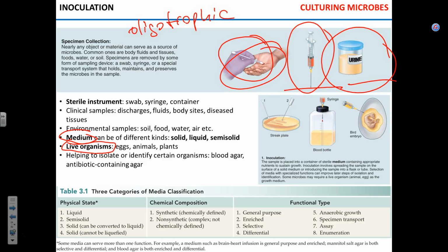So you have millions of different microbial species. Do all of them grow on the medium in the lab? Why not all of them will grow? Depends on what they synthesize and what they use for food. Sometimes medium is suboptimal, doesn't contain some essential factor, and the problem we don't really know. Okay? So, say you collect a sample from your skin, you put it on the agar, you have white and blue colonies, you have two types of microbes there, right? Does it mean that there are only two types on your skin? Not necessarily, right? Maybe some of them just didn't grow.